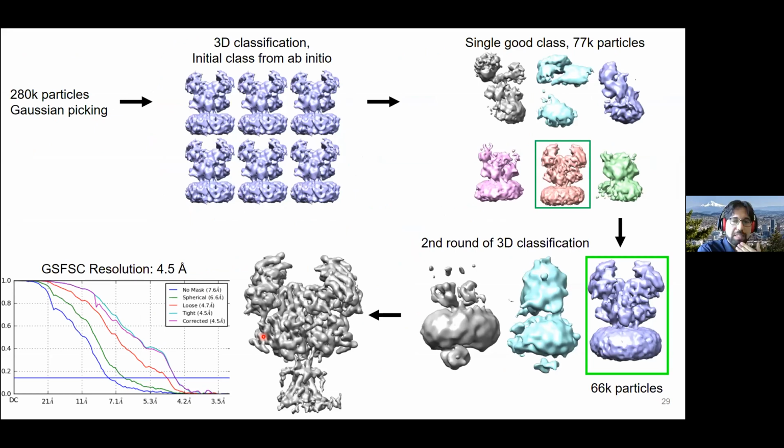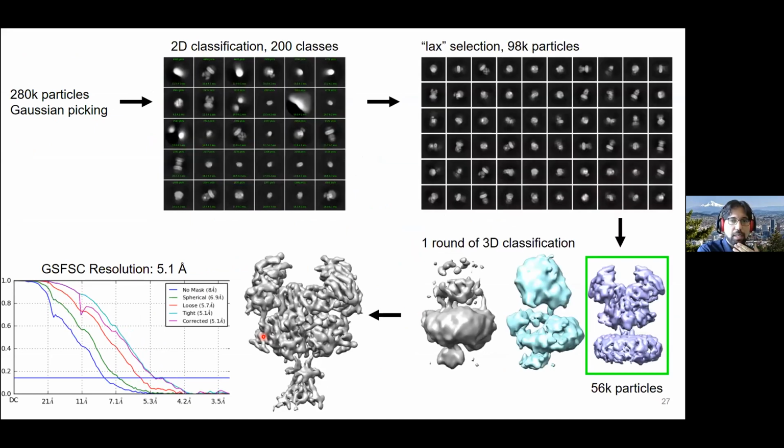So that's a good question. We generally try to get the model from our own EM data. In the past, I have used models from previous data sets, actually even recently, as long as I know that they're basically the same protein under similar conditions.